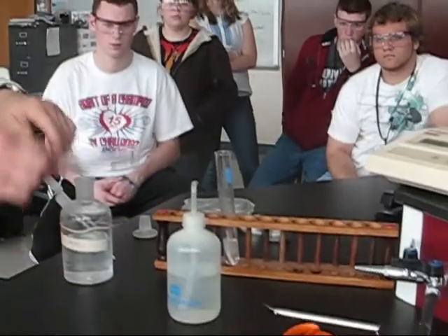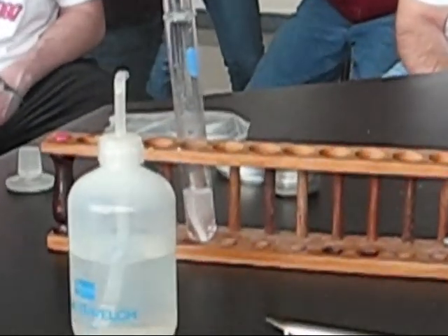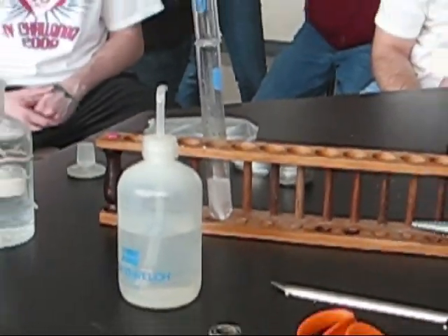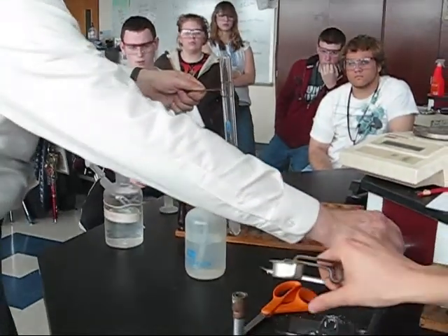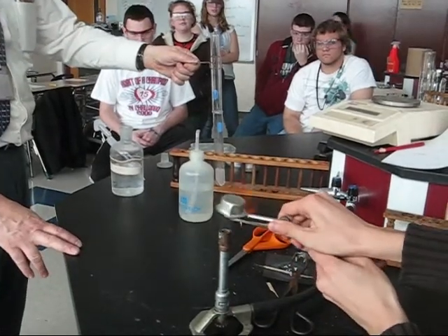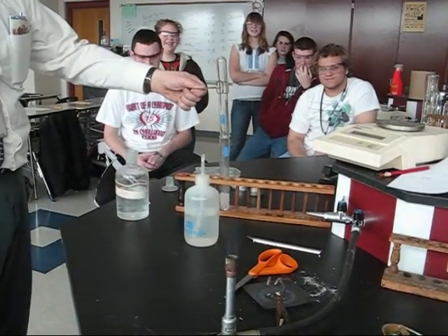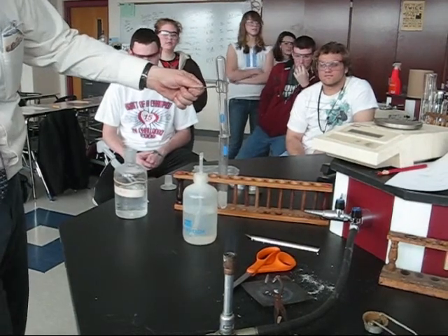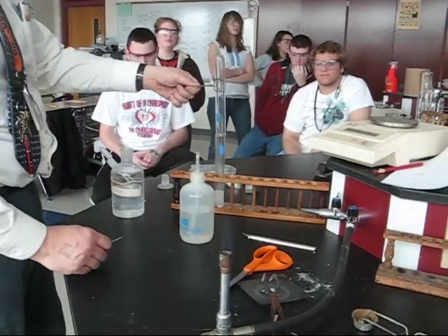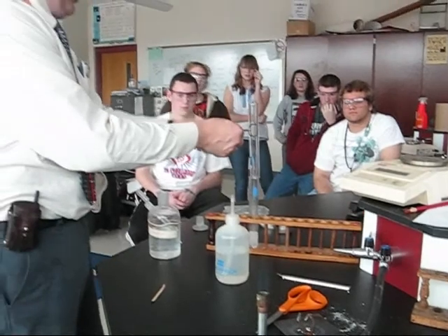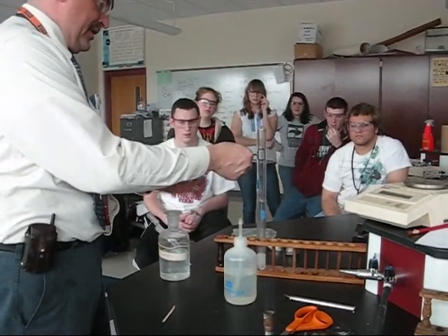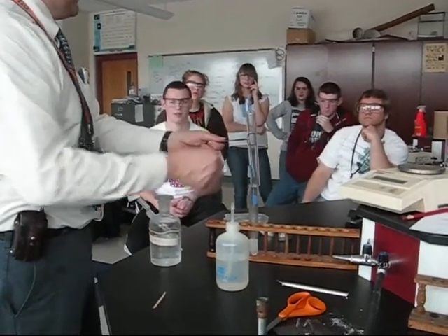I wonder what gas that might be. Let's try and catch that gas. Can someone light the Bunsen burner? I'm capturing the gas, and we're going to test to see if it's hydrogen. If it is indeed hydrogen, what should happen when I touch a burning splint to the open end of the test tube?